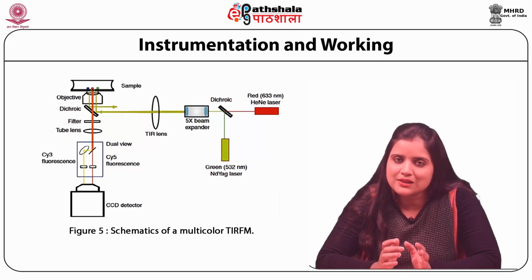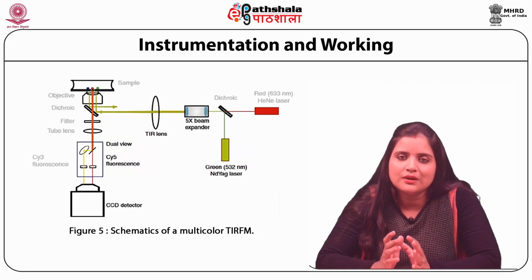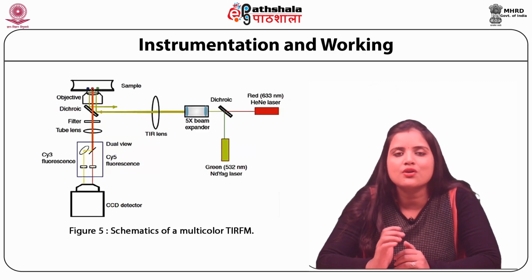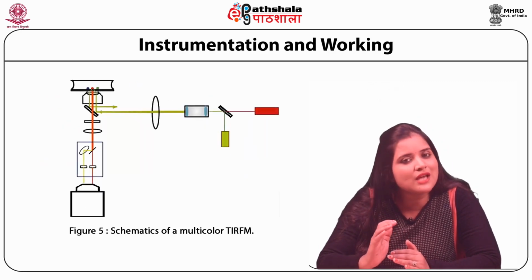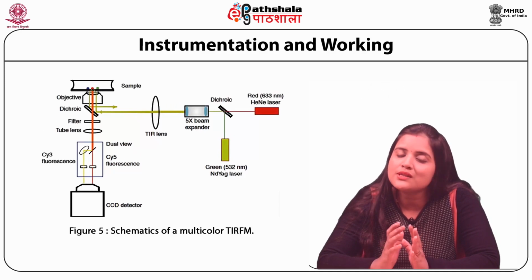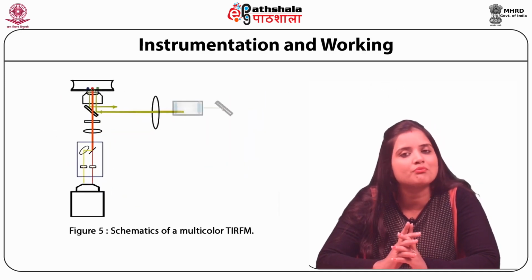Firstly, the lens position is adjusted such that the beam passes through the center of the lens. And secondly, the Z position is adjusted to focus the beam onto the center of the nosepiece of the microscope.